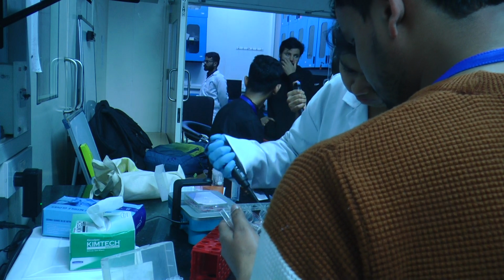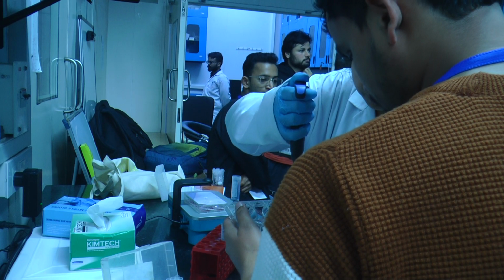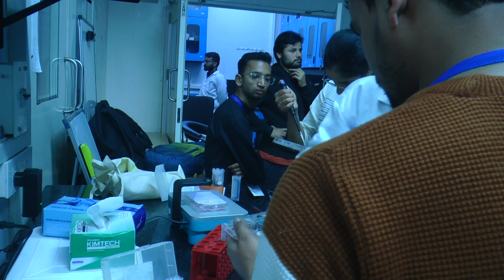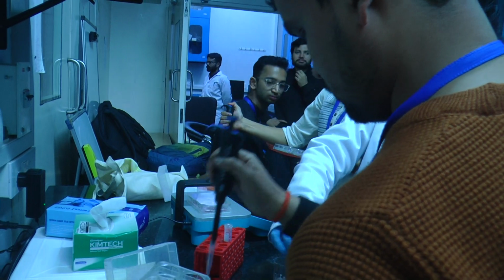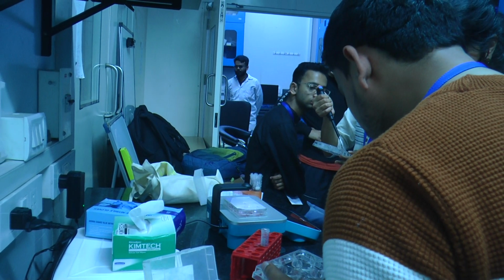Similarly we are using it here for the cells. We are giving them chemicals which will give them osmotic shock. Here it is a little more tricky because here we have cytoskeleton also. We have many other things also. So this is a calibrated concentration. The first one is a base, like a buffer.